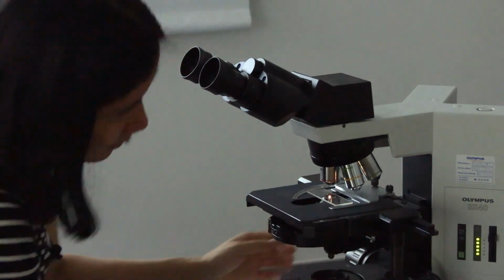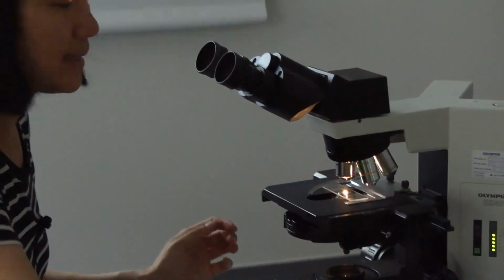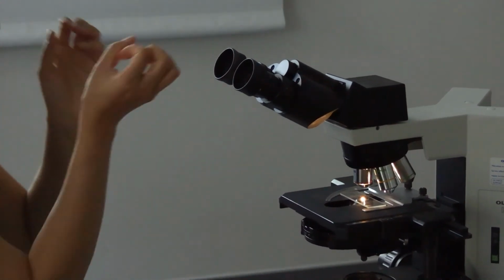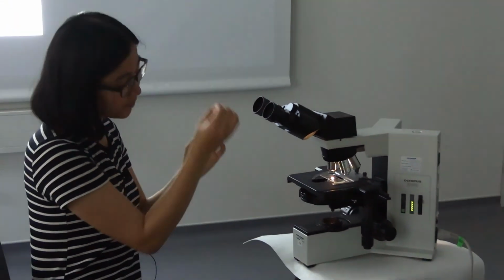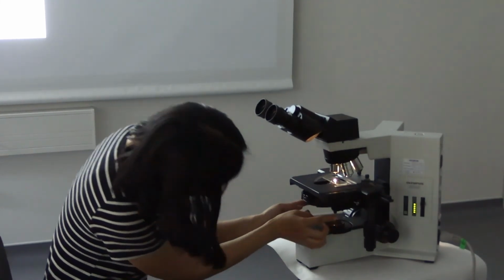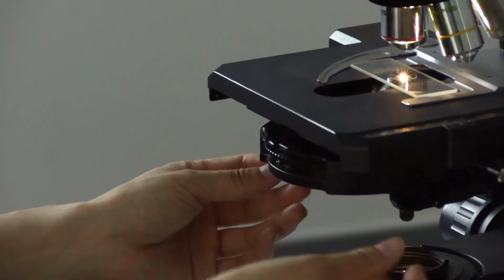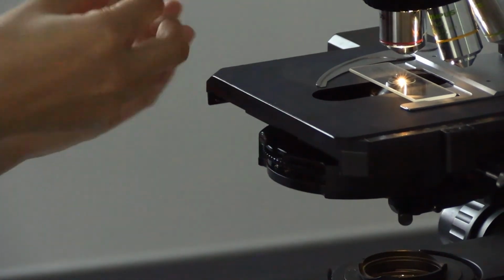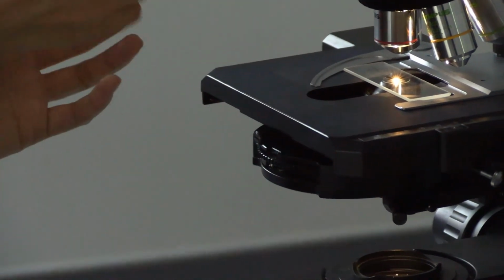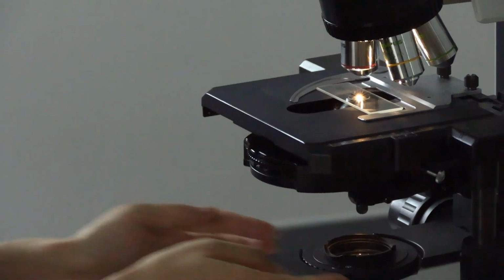And then you increase. If the light spot is not in the center, then use the two screws here to move it, one in one direction and the other in the other direction. Try to move the spot exactly to the center. So how do you know it's exactly the center or not?